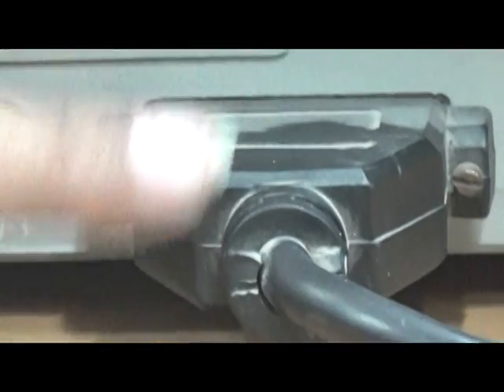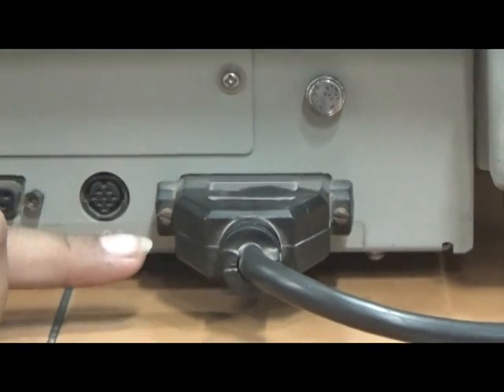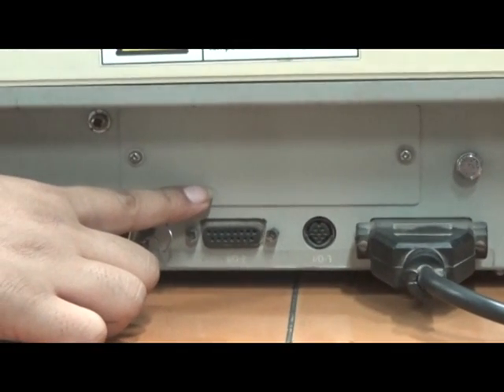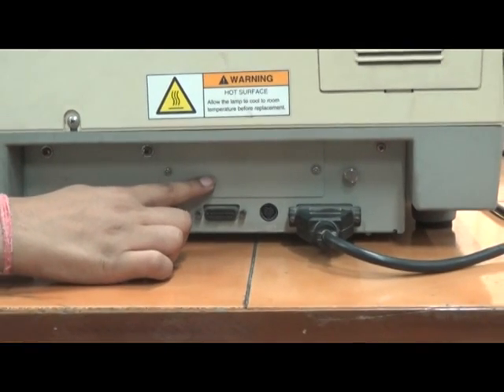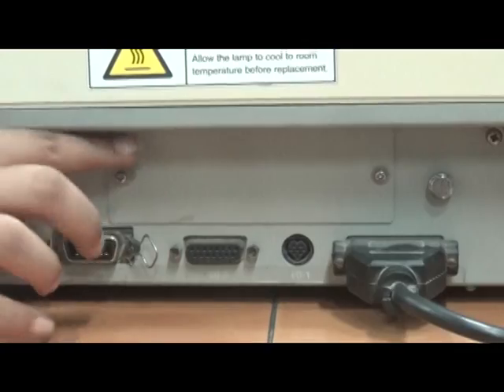This is called the printer connector, Centronics. This is the interface for connecting an optional printer. This is called the expansion board slot. This is the slot for inserting expansion boards such as the analog output interface board, etc. Normally the slot is covered, as you can see.